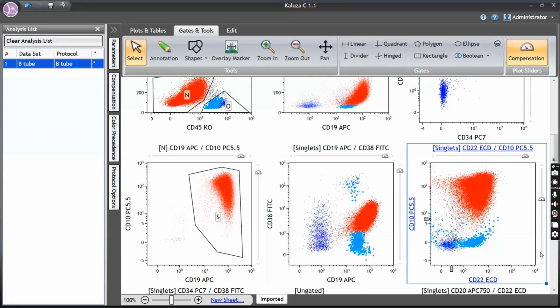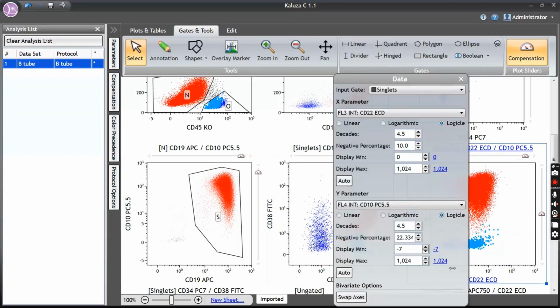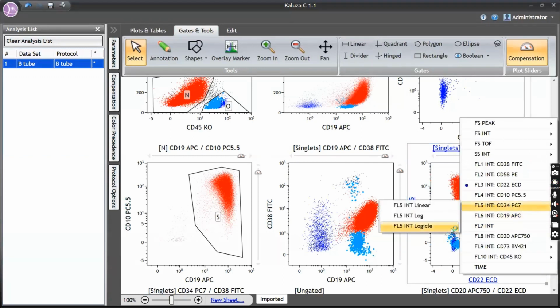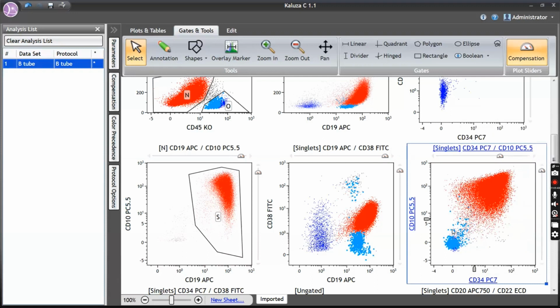Now what about the other marker? Very important marker, CD34. CD22 has come here. So let's see CD34 first. For CD34, you don't have an internal positive control. What you have is a negative control. So what is the expression of CD34? Negative? Moderate to bright? CD34 is on the x-axis. Moderate positive. Okay, CD34, see the x-axis.